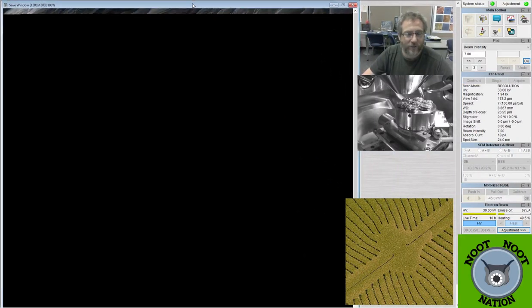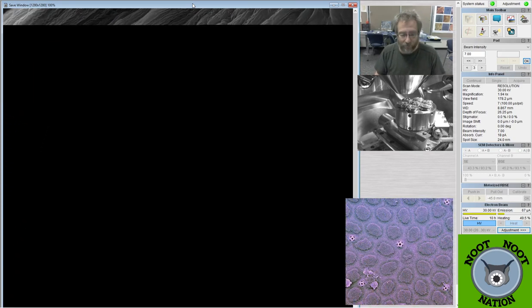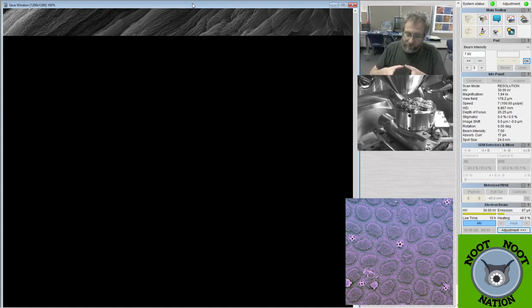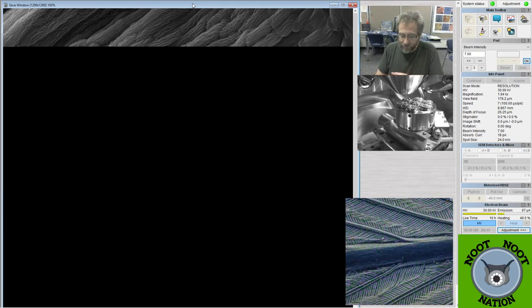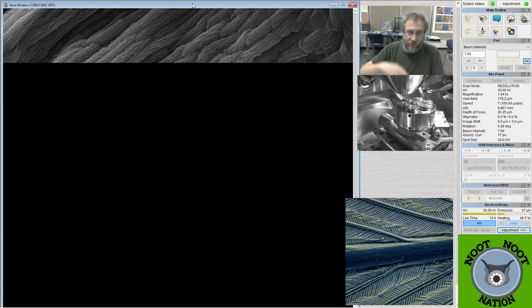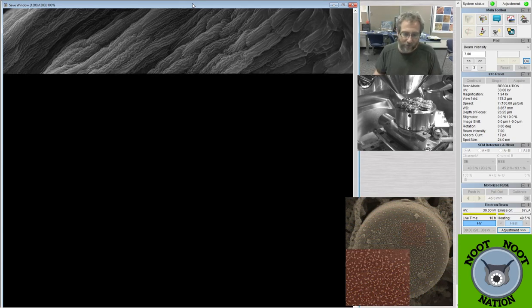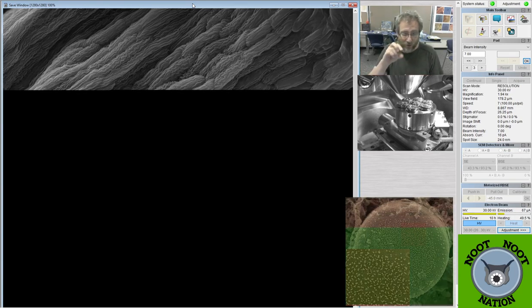And when I changed the beam intensity, it actually changed the size of the beam, the amount of information that the beam is collecting, really. So the electron's hitting the surface, and at beam intensity 10, maybe the circle's this big, and at beam intensity 7, it's maybe this big. So the quality of the image improves because the area that's sending back information is smaller, right? So just think of it like using a big paintbrush and a little tiny paintbrush, right? But if I made dots with a big paintbrush, it would be a lot brighter and you'd see a lot more color, but I wouldn't be able to get as much detail.